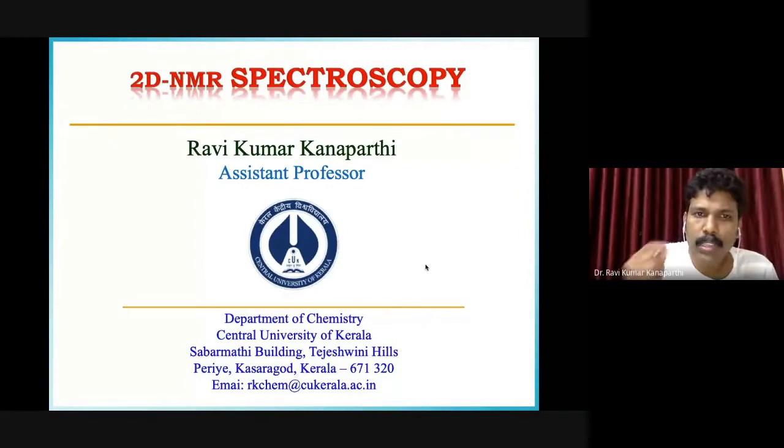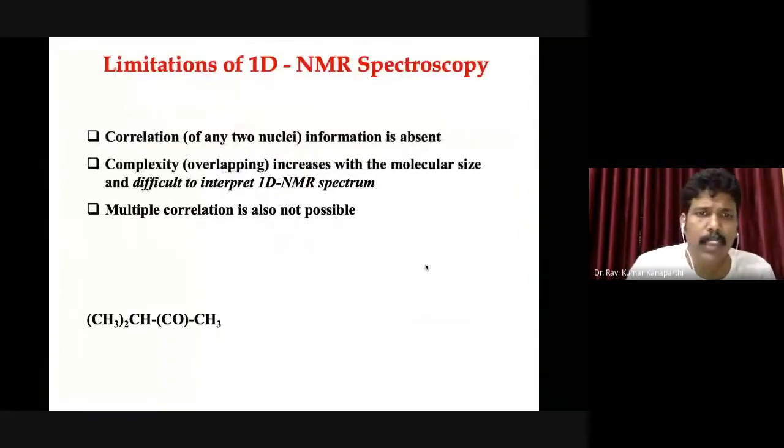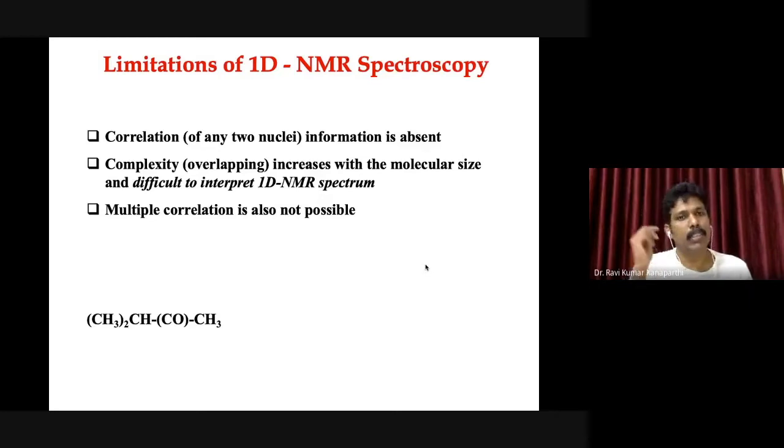Before going to 2D NMR spectroscopy, let me tell you why we need it. We need 2D NMR spectroscopy because there are certain drawbacks or limitations with the 1D NMR spectroscopy, which we have learned so far.